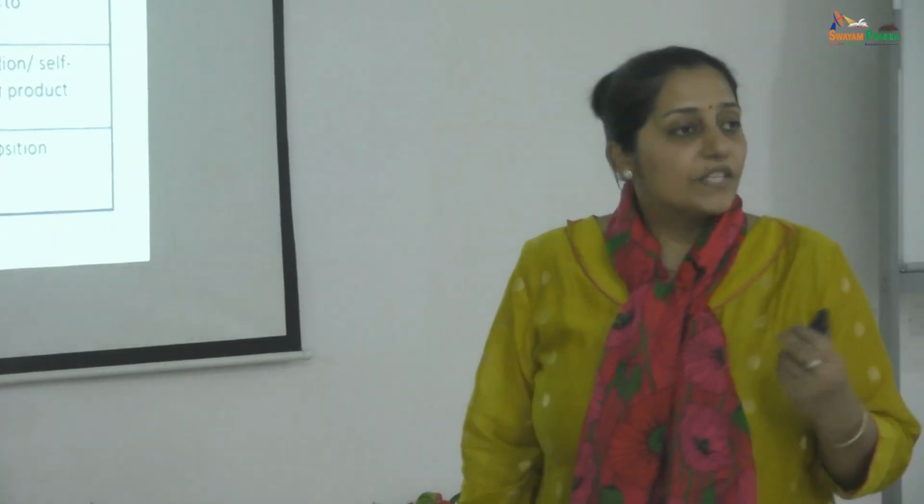Now, the question which should crop up in the mind is, it is a lot of hit and trial. I keep testing all the impellers, and every batch is taking me a month. So how much time and energy will go into it? What can be a better way to do it? Obviously, if we can have a tool which can predict the impact of the impeller design on the reactor hydrodynamics, and it can be made measurable.